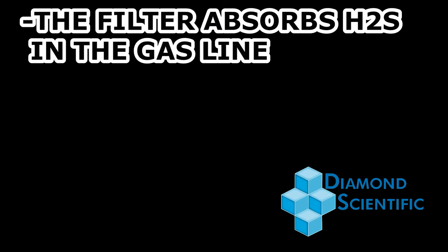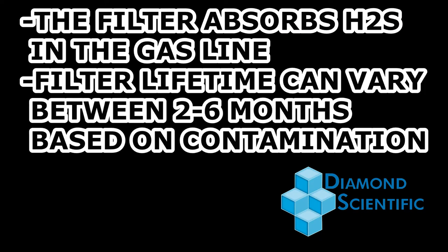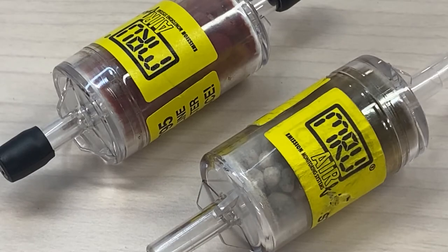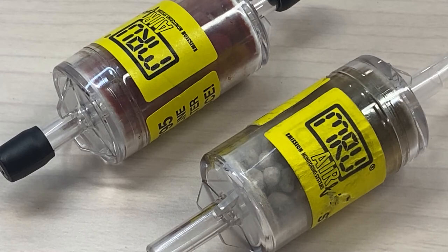The filter's purpose is to remove and absorb hydrogen sulfide traveling through the gas tubing. Depending on your local gas concentration, you should get between two and six months out of every acid gas filter. Remember, the filter will whiten with use, so do make sure to keep an eye on it and replace it when necessary.